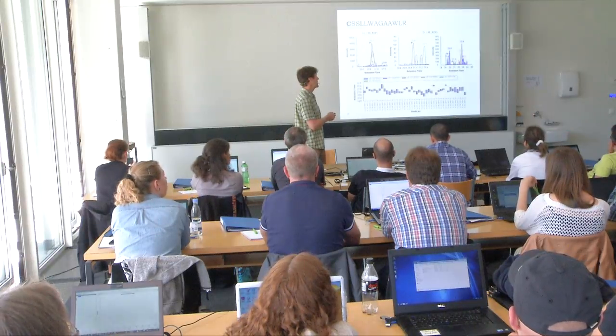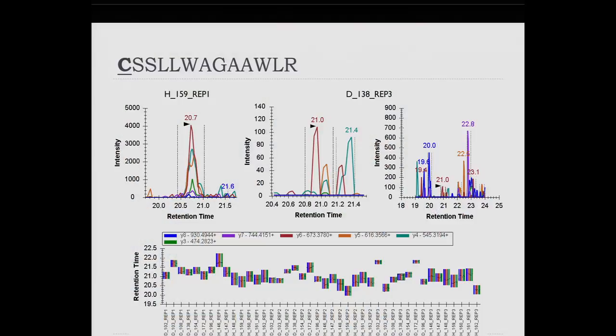an example of the diseased group, this is what I've chosen to integrate. It's really hard to even see that these are co-eluting, but at least the most intense thing is down at 100, where this is up in the thousands. But the most intense thing is my transition, my Y6, and then I'm getting somewhat similar signal over here. But you never would just integrate this on its own.